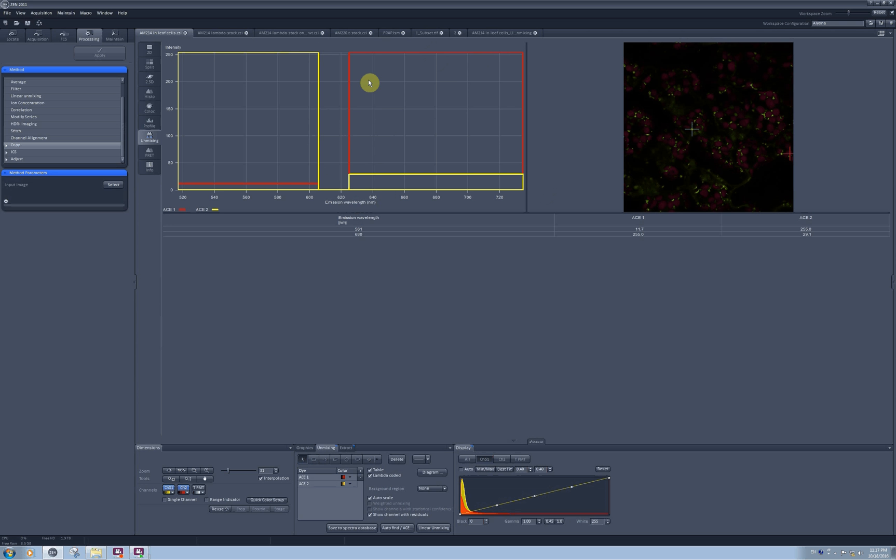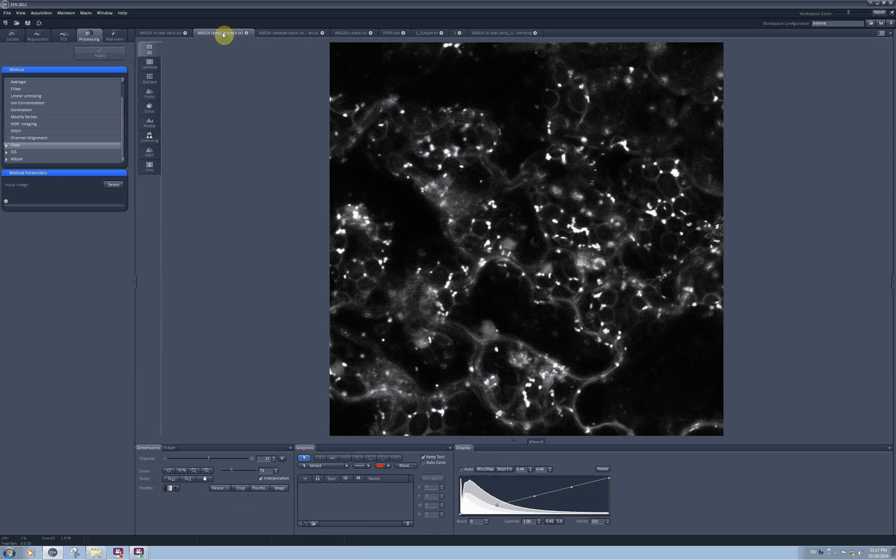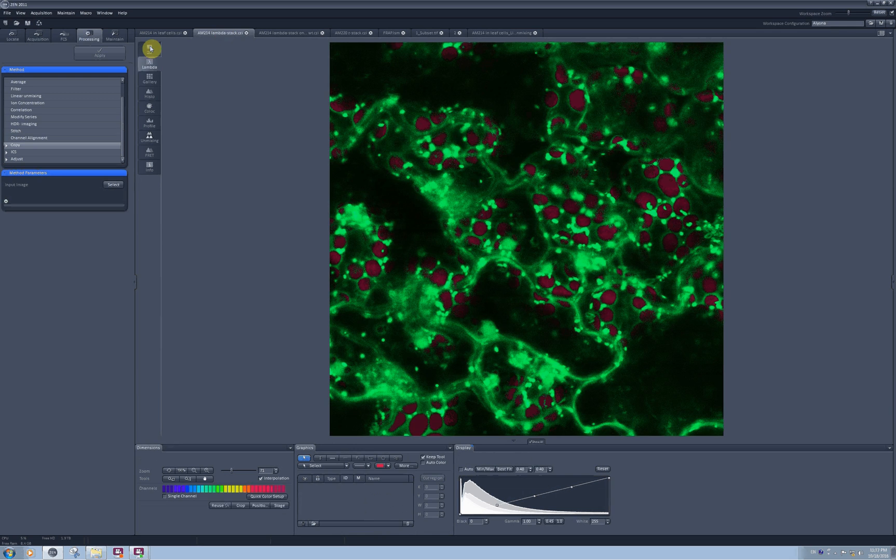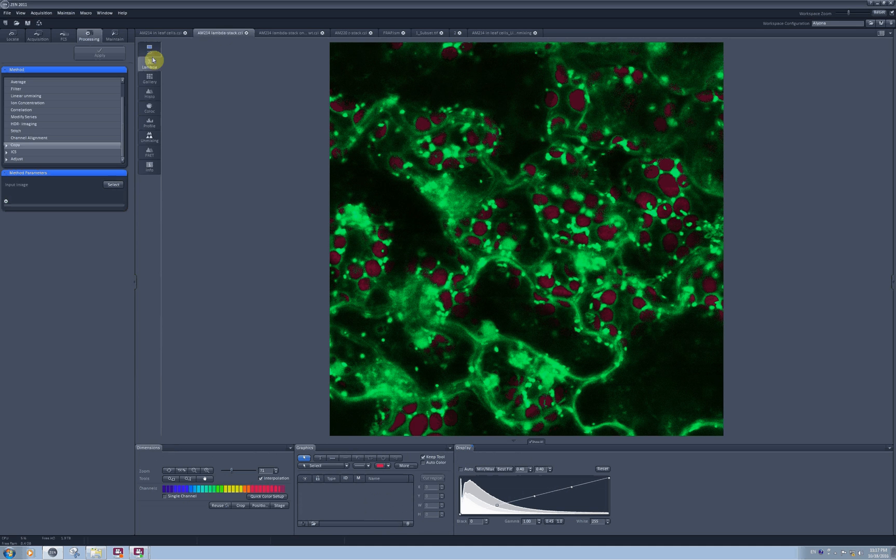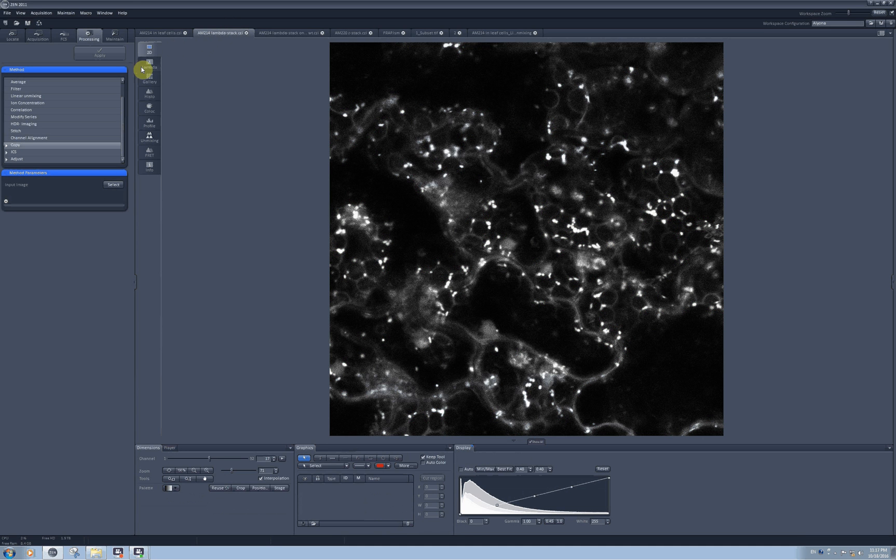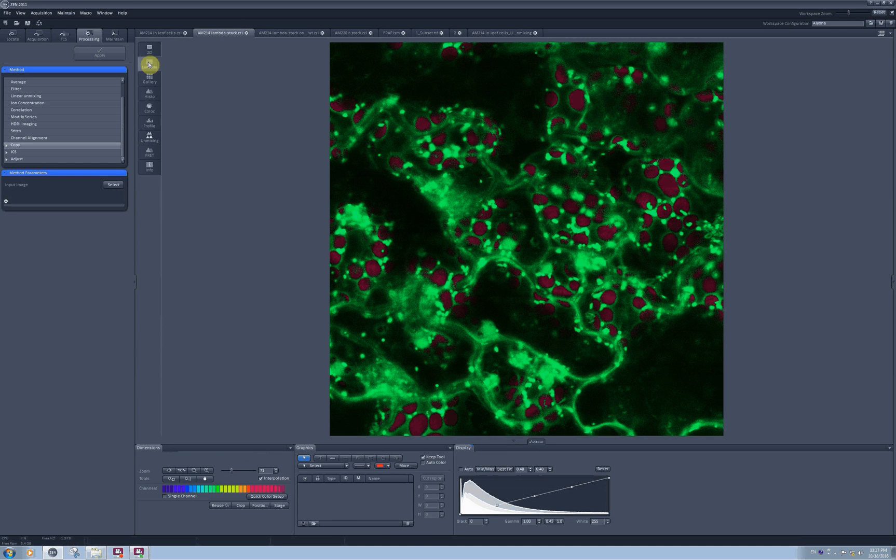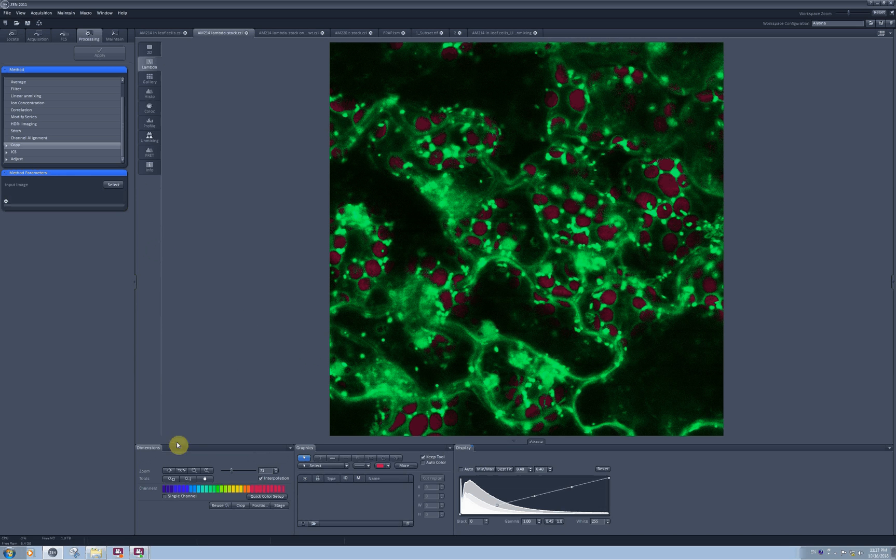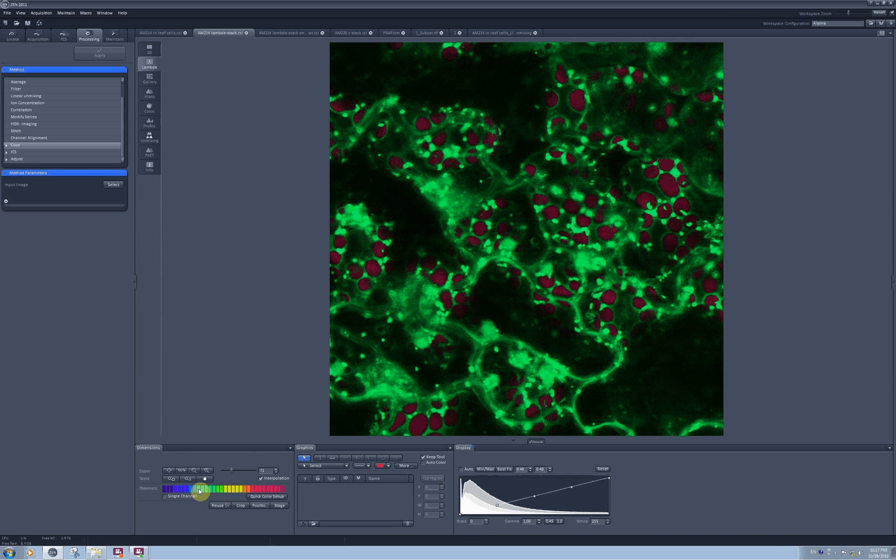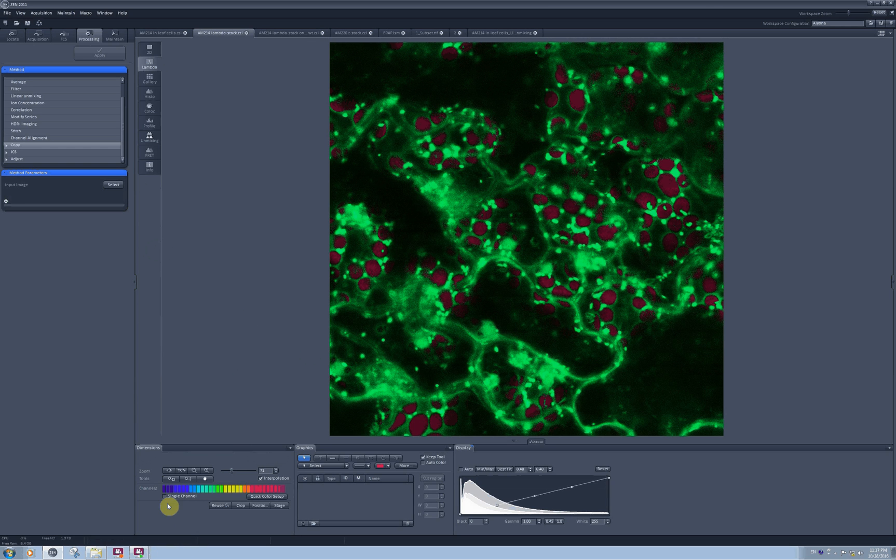You can get a much better estimation of what intensity should be removed from what channel if you perform a lambda stack. If you have a lambda stack image, I have it right here. As soon as I open the lambda stack image, I can see a lambda mode representation of it and I can see individual channels for each of the detectors I used to make this image.